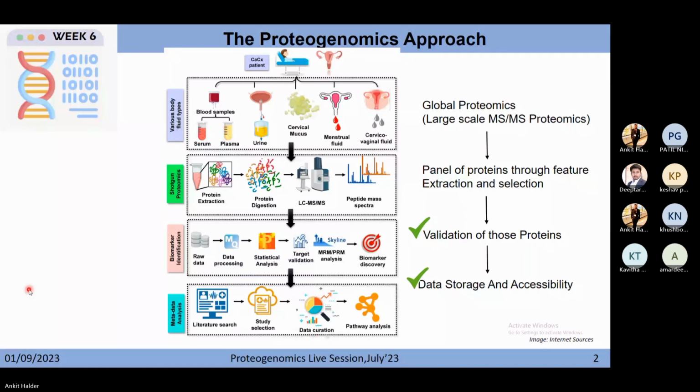So now at the genomics level, you can identify your variants and your SNPs. Now in the proteomics study, we have till now gone through the steps starting from sample preparation, proteolytic enzymes, then mass analyzers in mass spectrometry based proteomics, then how you will analyze your data.